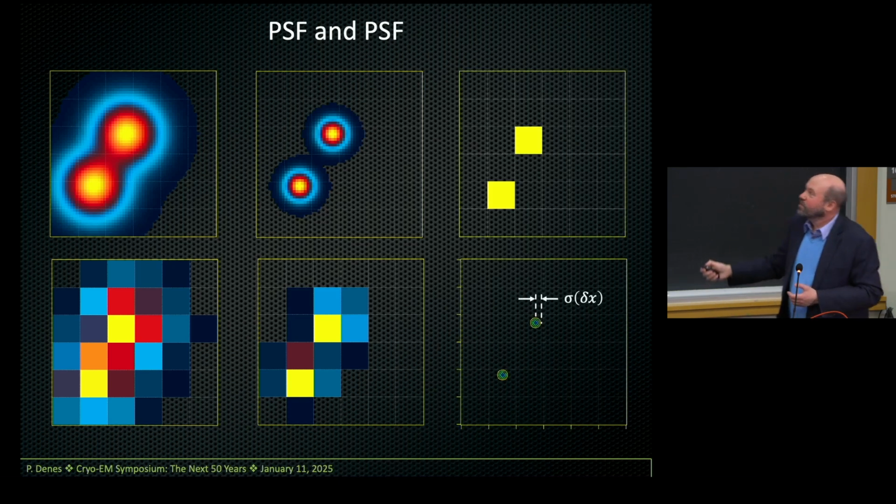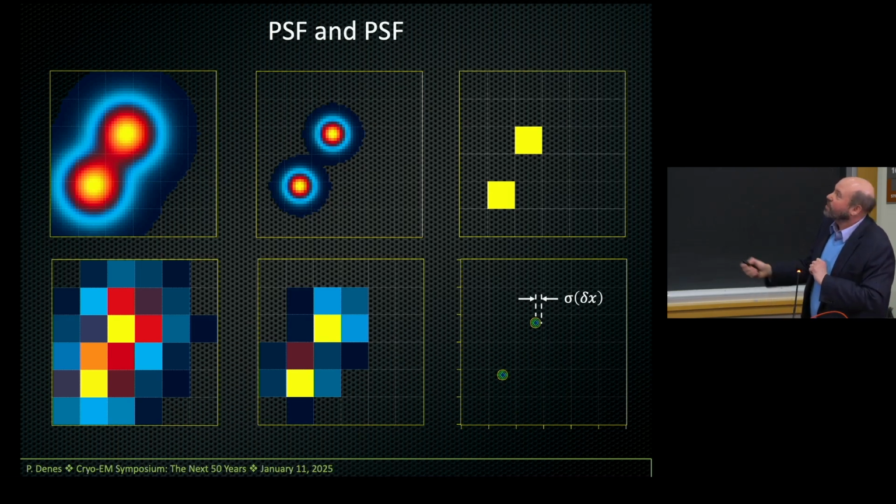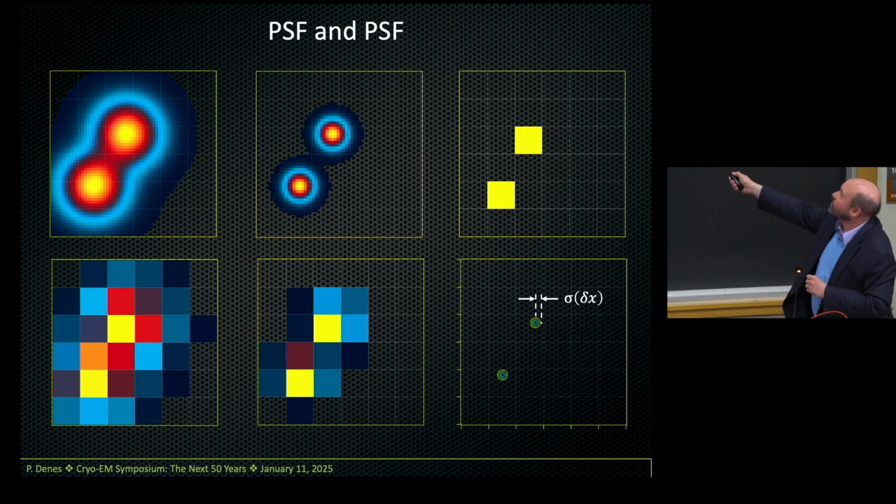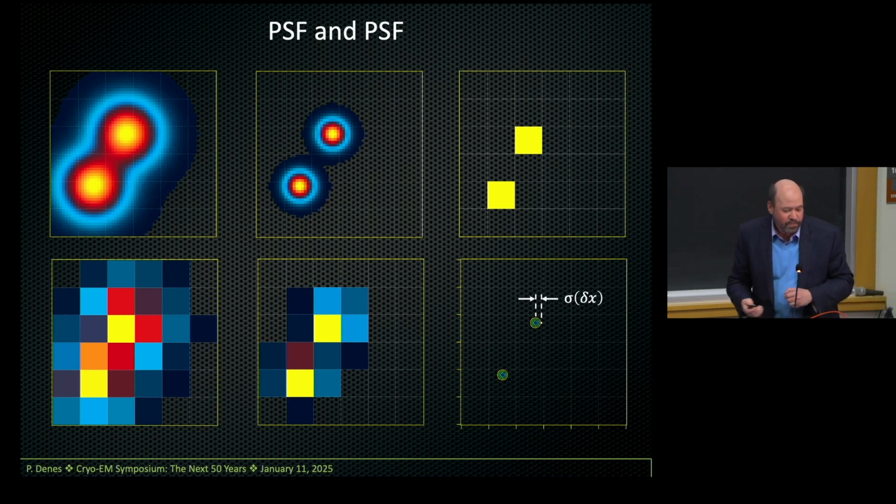But when you count, you don't care about what the point spread function in the sensor is because you're actually using that information, and you're either just assigning each position to a mythical Shannon pixel, this pixel is hit, or even better, saying I've localized to within the spatial resolution of how well I can count, not the spatial resolution of how the signal spreads in my sensor, and that's how well my sensor can do.